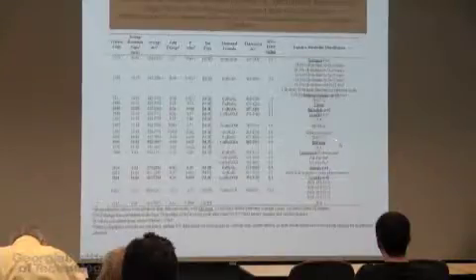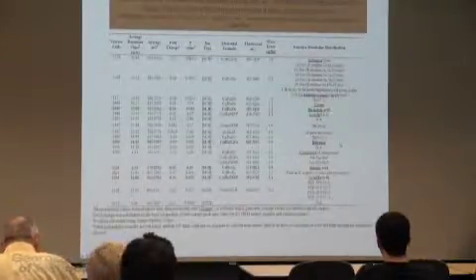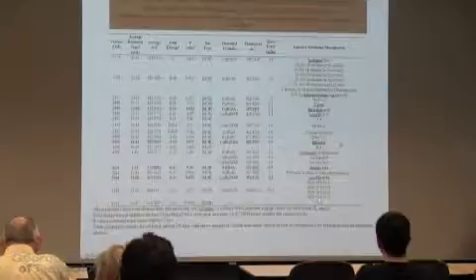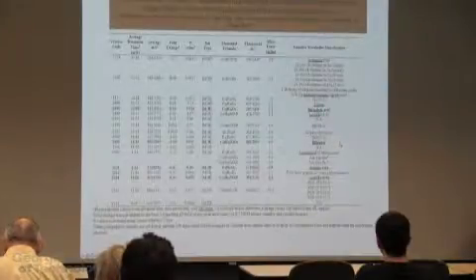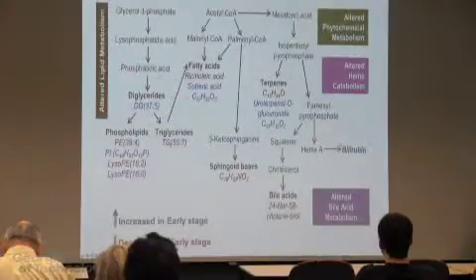Okay, so the ones that are bolded, for example here, one molecule that was really interesting was bilirubin. Okay, bilirubin was changed in this panel. There are many lipids, phosphatidylinositols, some bile acids, and some triglycerides, but there's some molecules, for example, N/A. Okay, N/A. So this is by no means completely done. Okay, but if you, with the tentative IDs, if you go back and you map this into pathways, you see really many changes.